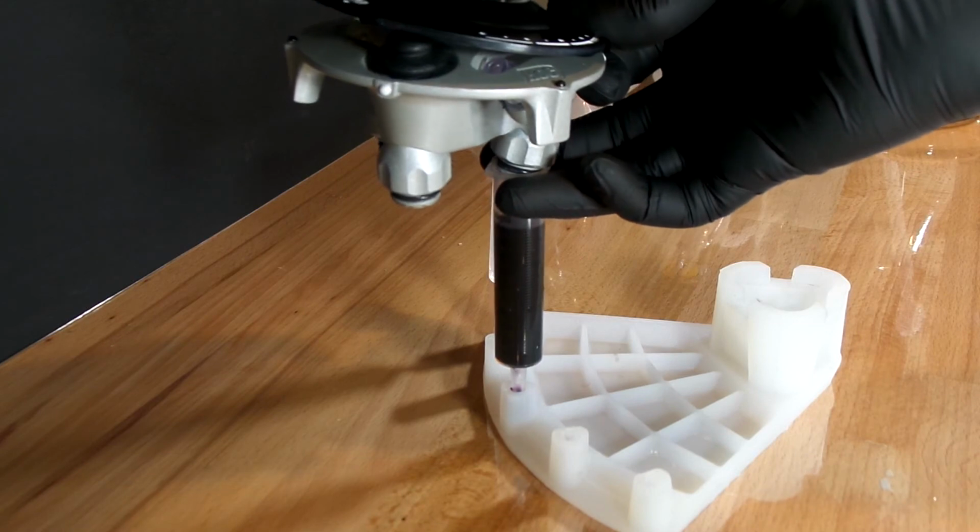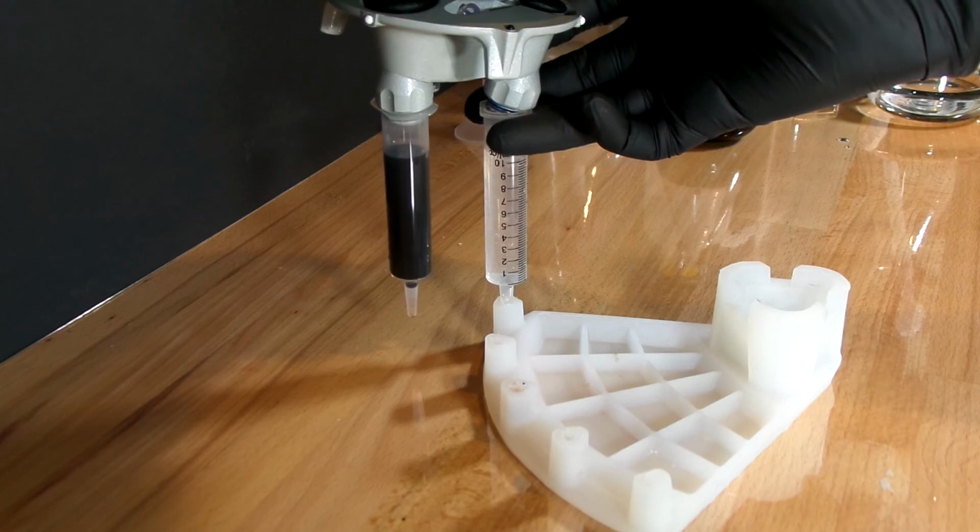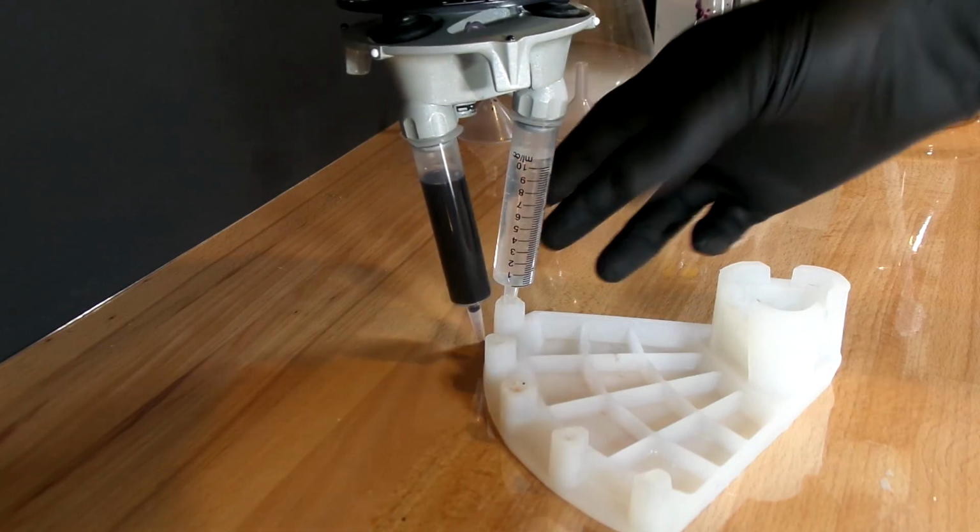Pick up each cartridge with a fitting located on the pipettor body. To ensure that no fluid is lost due to a buildup of pressure, please depress the associated bellow in advance.